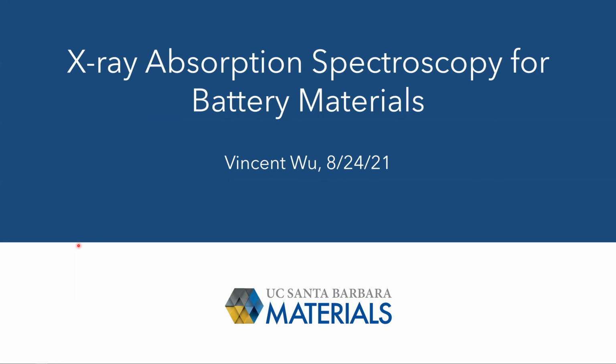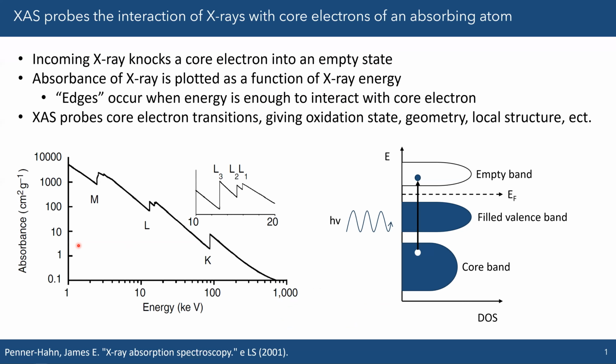So today I'm going to be presenting on X-ray absorption spectroscopy for battery materials. I want to first go over the basics of XAS and what it really is. In an X-ray absorption experiment, what you're doing is basically shooting X-rays at a sample.